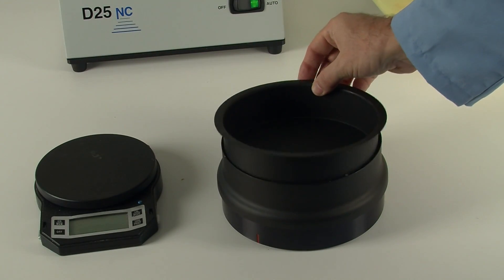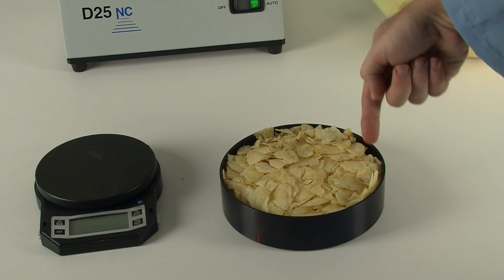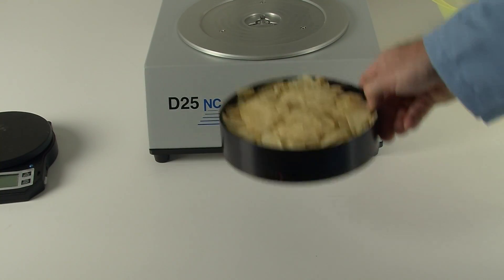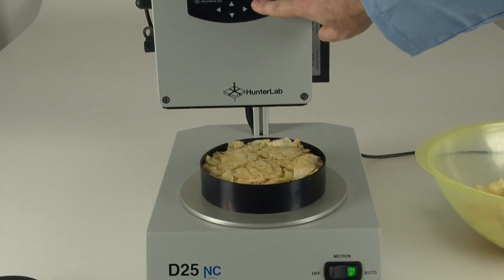Remove the pan and collar and check that there is an even distribution of chips. Make sure that you've selected the proper product setup. Place the sample under the sensor and press measure.